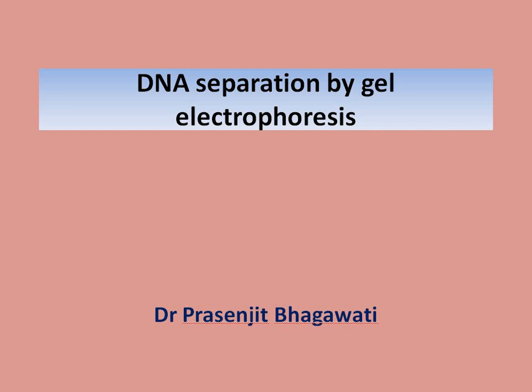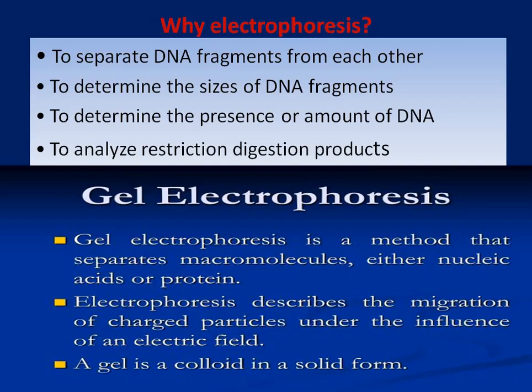DNA separation by gel electrophoresis. First of all, we have to know what electrophoresis is and why it is used. Actually, it is used to separate DNA fragments from each other.